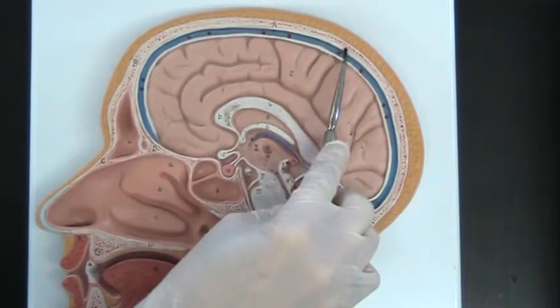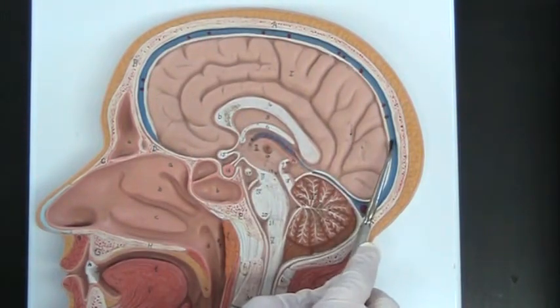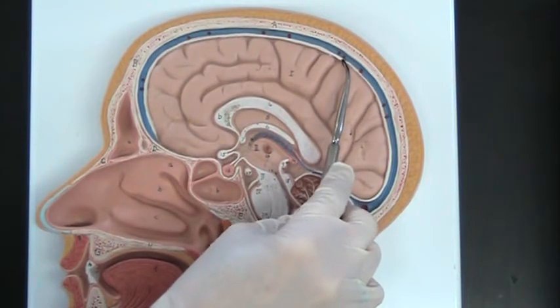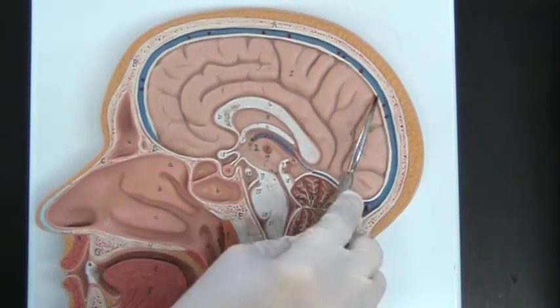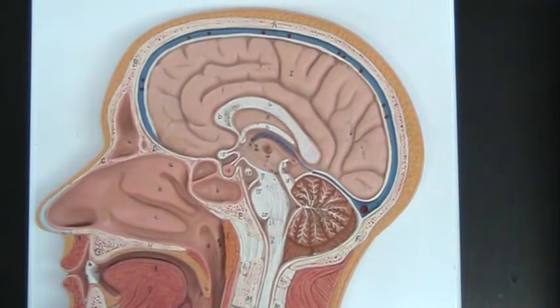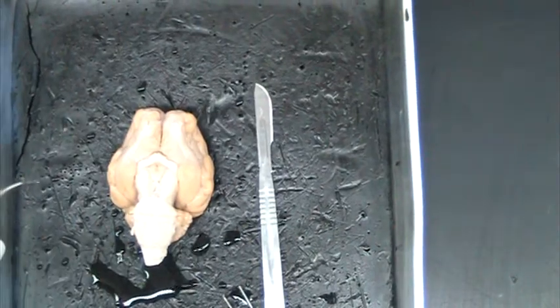So the meninges, again, is the three layers. And cerebrospinal fluid, or CSF, is located between the arachnoid mater and the pia mater. So you think subarachnoid for where the cerebrospinal fluid is located. That fluid, of course, is for protection and buoyancy of the brain, etc. Okay, if that's all the parts of the brain that we'll look at, then we're going to dissect a brain. So let me bring in the brain right there.